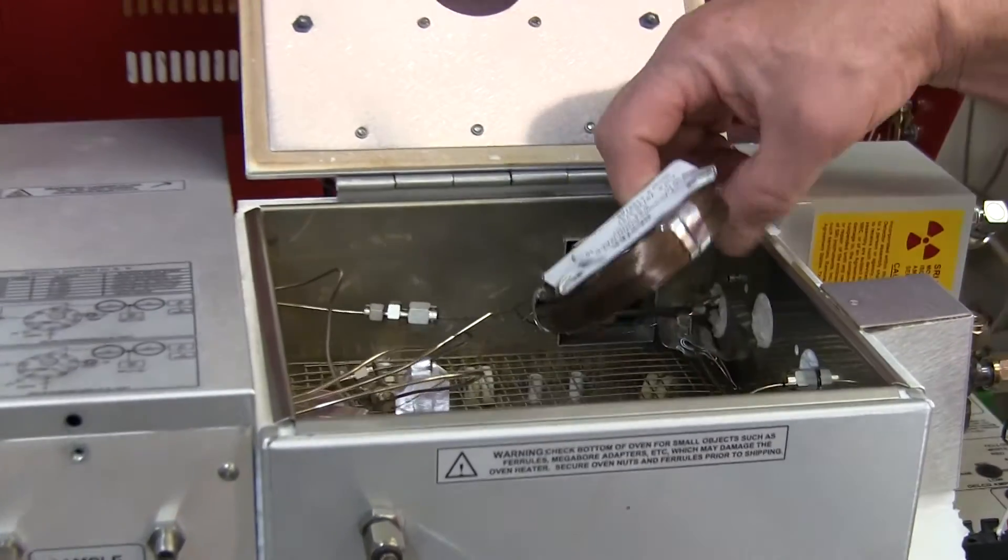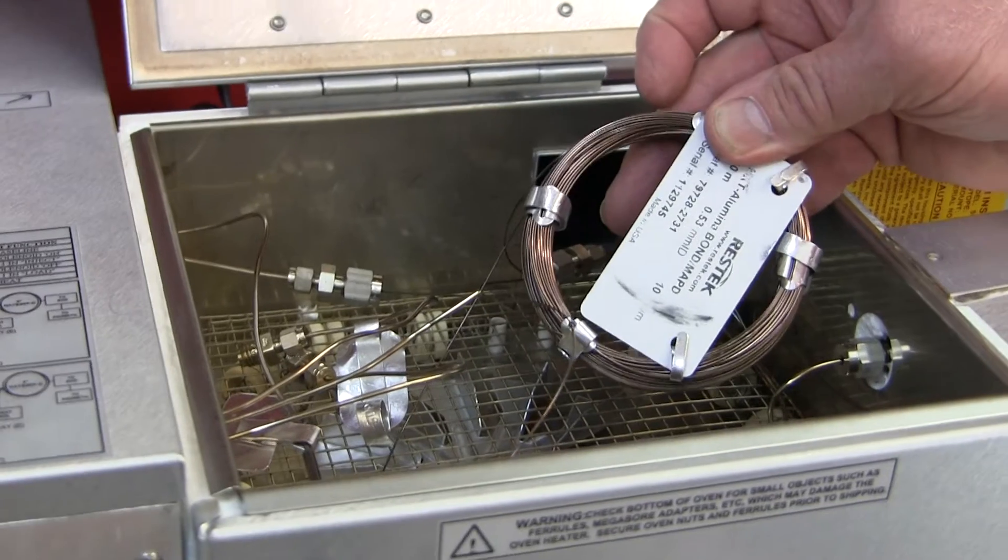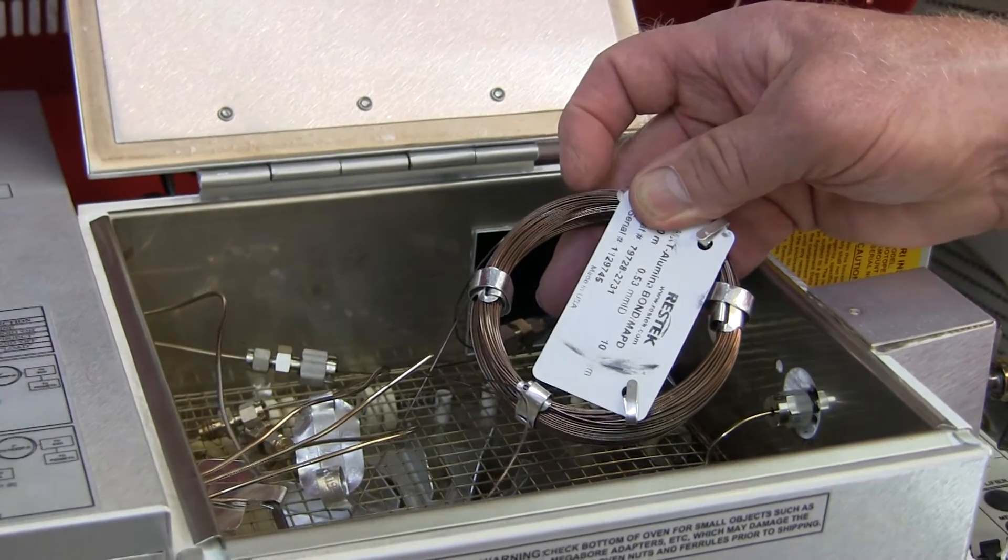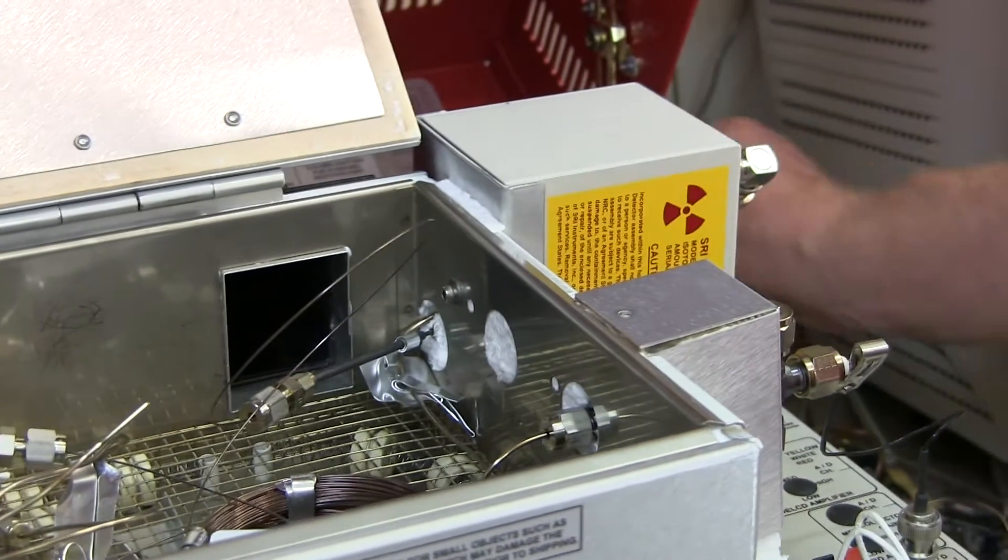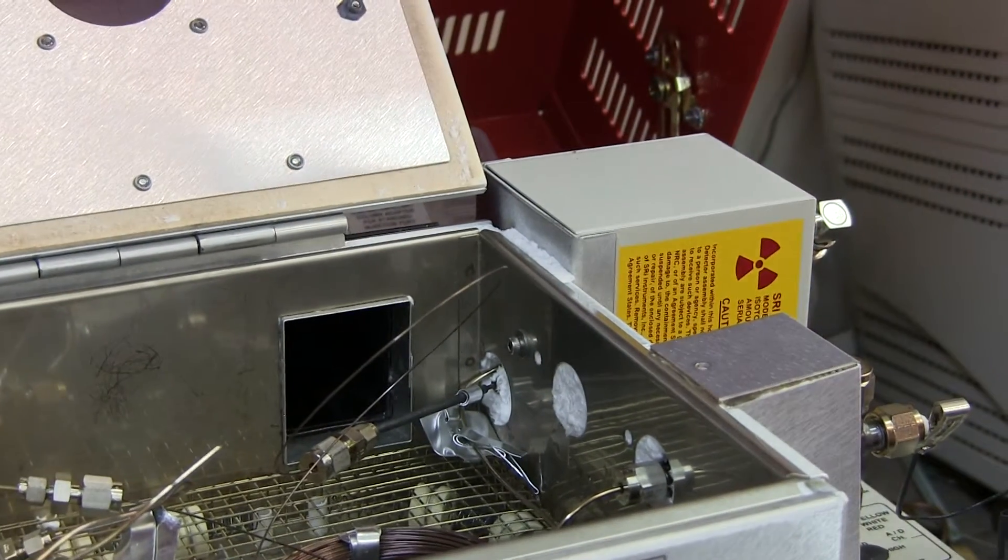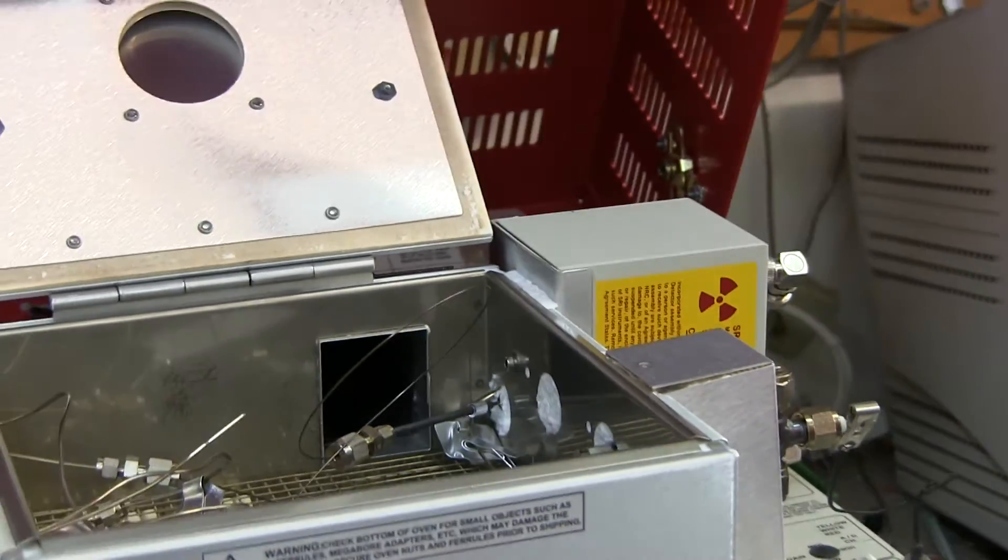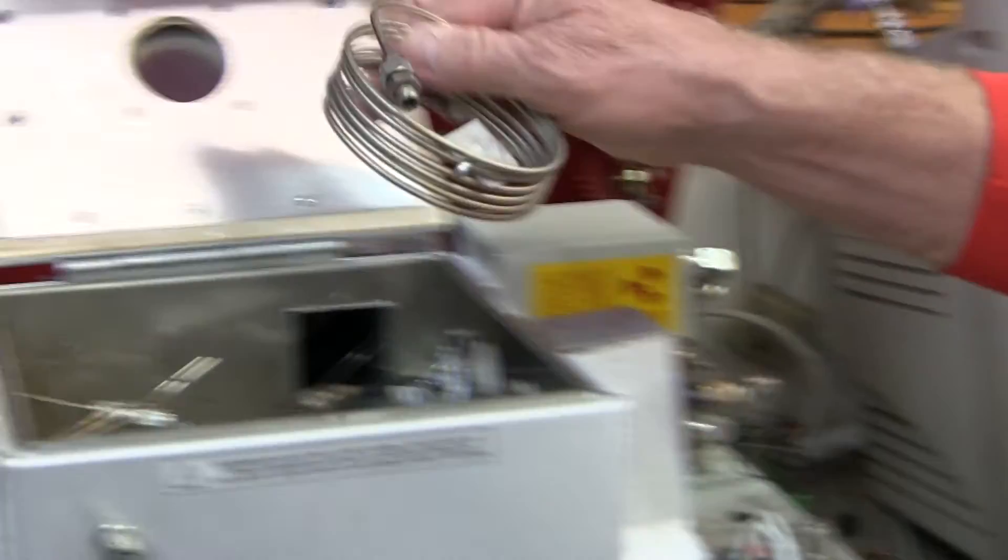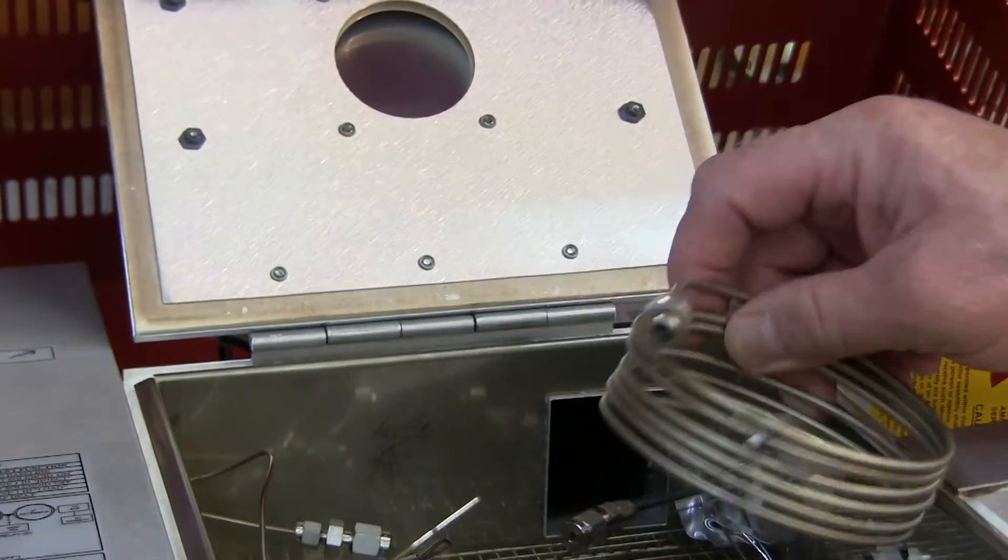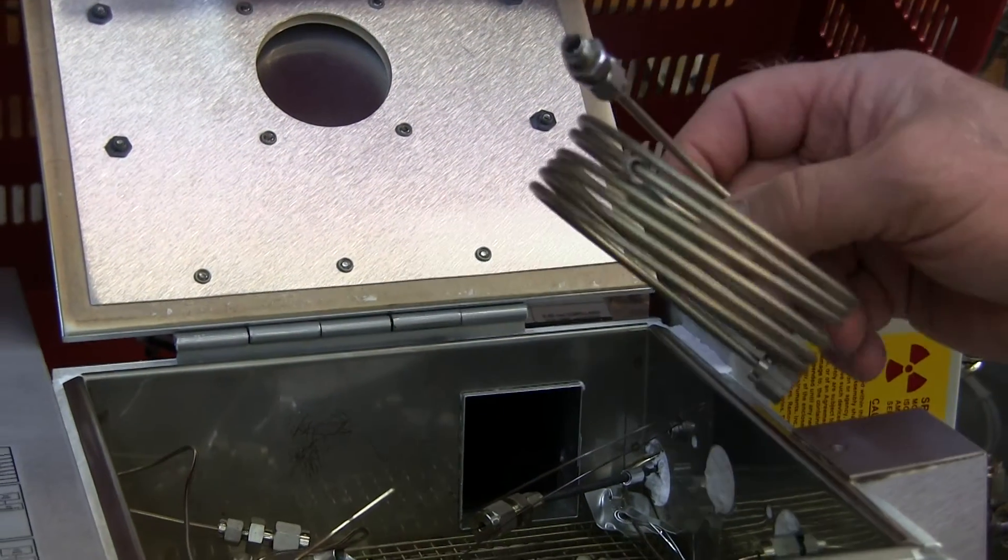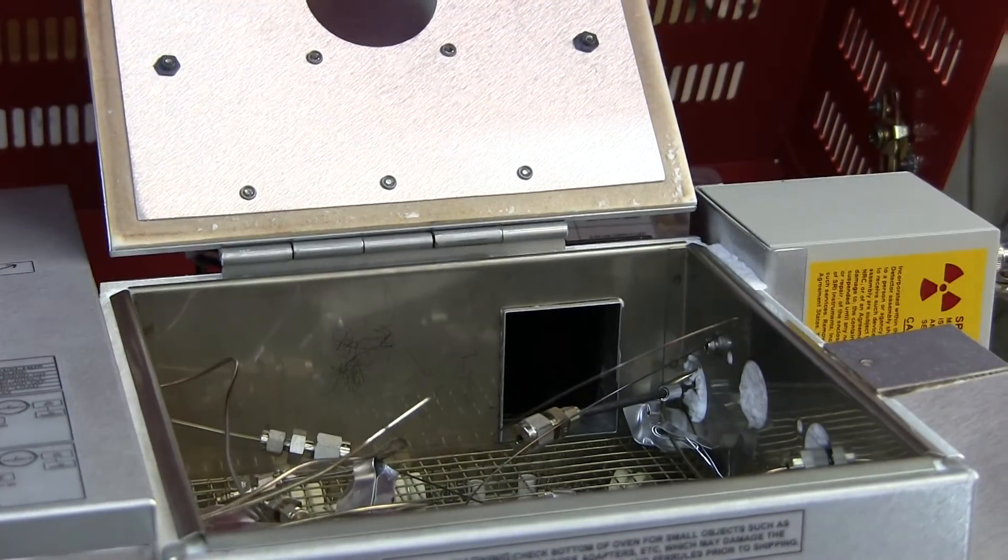The column oven is here and it's a very precise temperature controlled oven that can vary in temperature from ambient temperature to 400 degrees centigrade. Inside of the column oven, there's going to be some kind of column. It may be a capillary column like this or it may be a packed column that looks more like this. Columns come in all shapes and sizes and there's enough room in the column oven to put four or sometimes even five different columns.